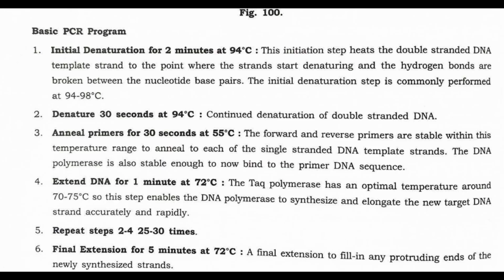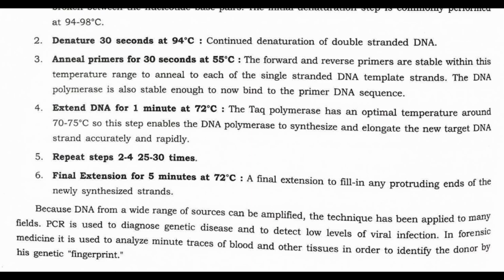Step 5, repeat steps 2 to 4, 25 to 30 times. Final step 6, final extension for 5 minutes at 72 degrees Celsius. A final extension to fill in any protruding ends of the newly synthesized strands.